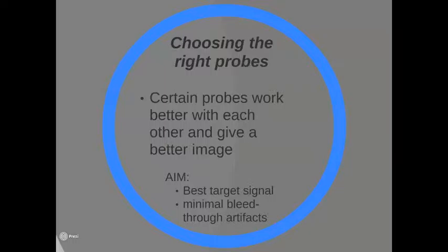There is also a consideration to make when choosing the probes you would like to use for your imaging. Certain probes work better with others, and it is important to choose the right ones in order to obtain the ultimate goal of an image with the best target signal and the minimal bleed-through artifacts, as discussed previously.